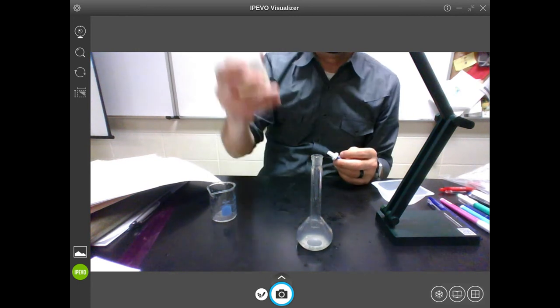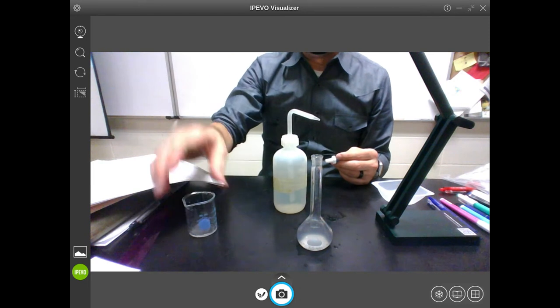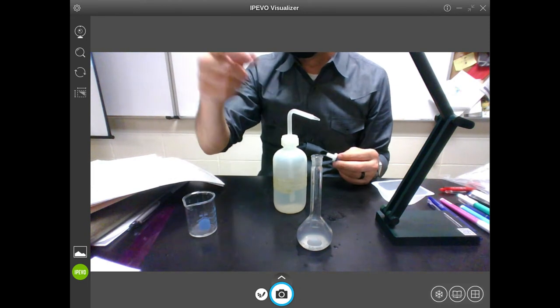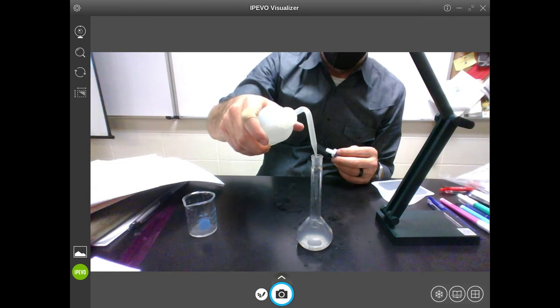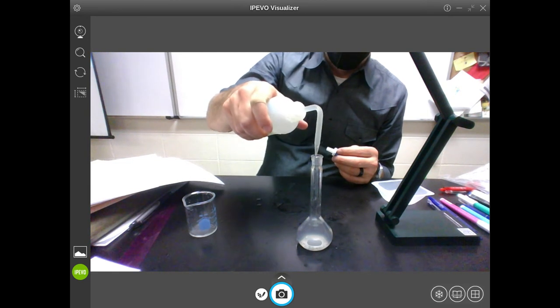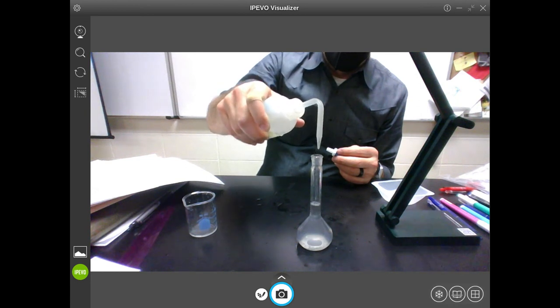Then when you get close to the line, you can still use this, or I'll also give you guys pipettes. You can either use this or pipettes. These are pretty good. You can still usually add this drop by drop, but when you get really close to that line, and you can see even on this one, it's filling fast.